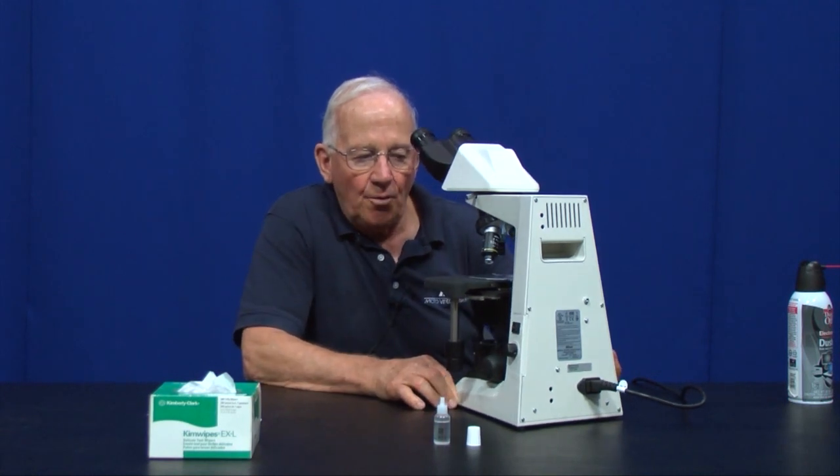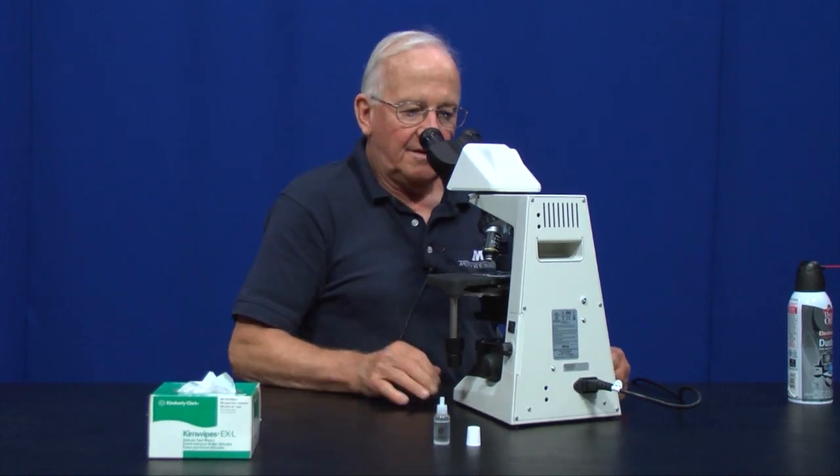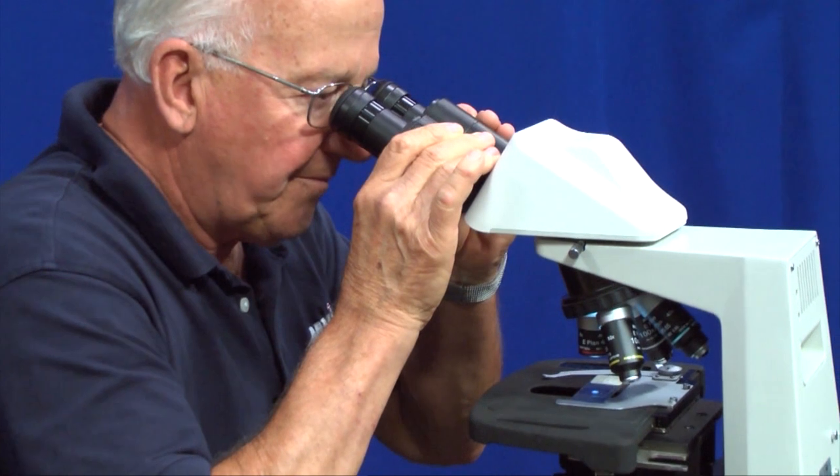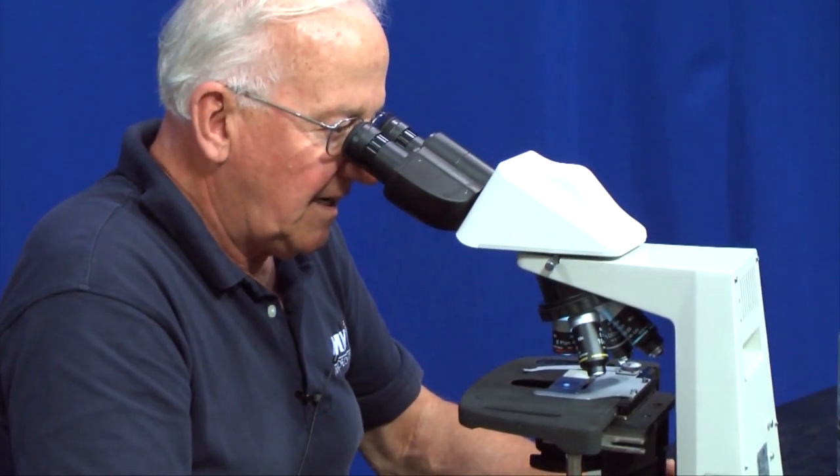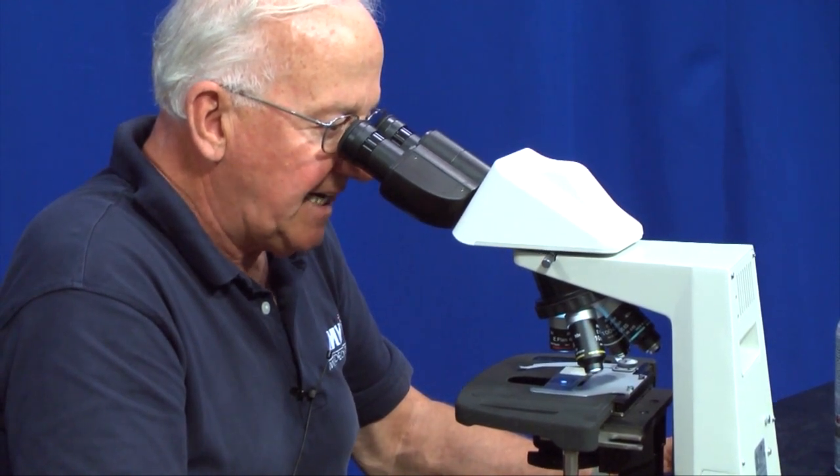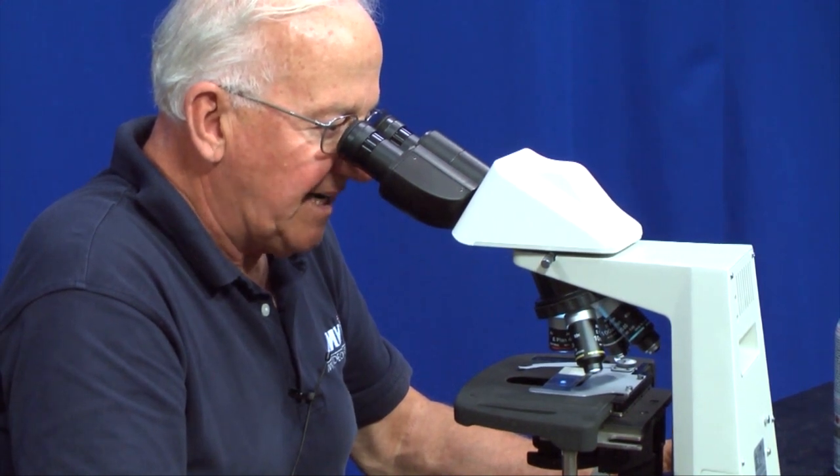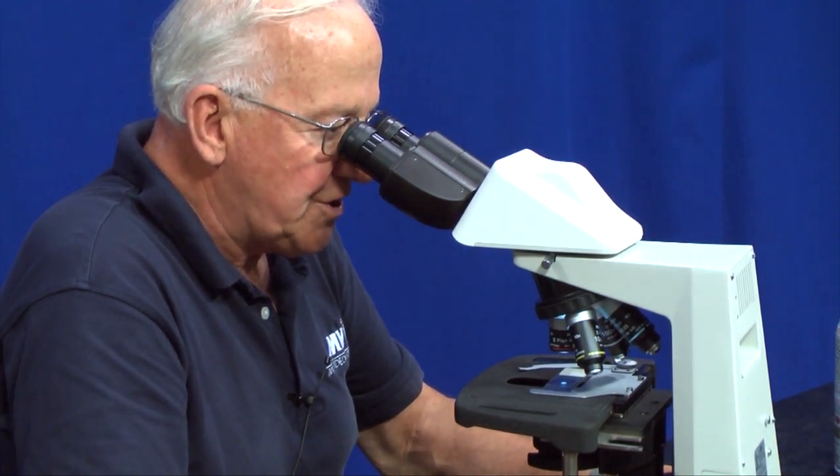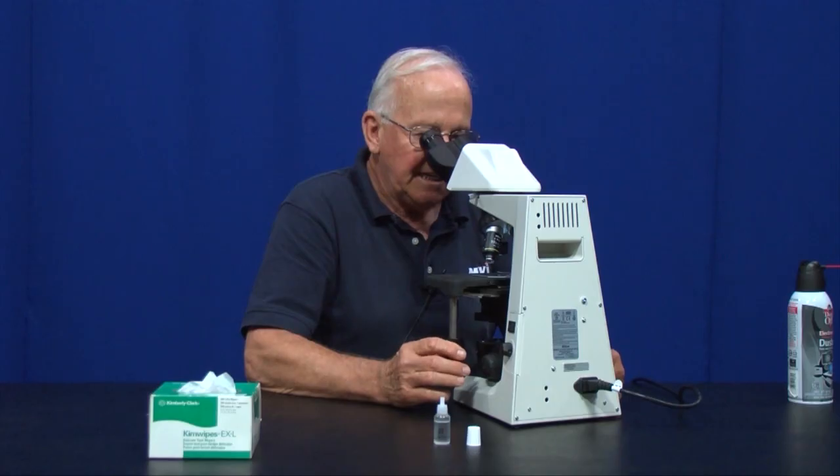Rack the stage up all the way until you feel a little bit of resistance. Now adjust your eyepieces so that you see only one image in the eye tubes. If you move the slide slightly while looking in the microscope, you will see probably a little bit of dust moving. If you do see that, that means you're pretty close to being in focus. Then use the coarse adjustment a little bit to drop it down until you see the image.